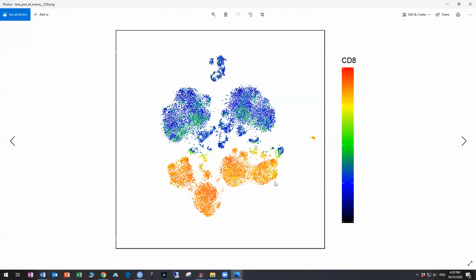If you find that this is just sort of a mess and there's not really any clear groups anywhere, you may need to redo the compression of the negatives, or think about how to better set up your experiment in terms of what cell populations you work with, or how many iterations you need to run, or what markers you're using for the analysis. Some cell types like Tregs, you will basically just get one cluster that sort of roams off here and there because they're all so related.